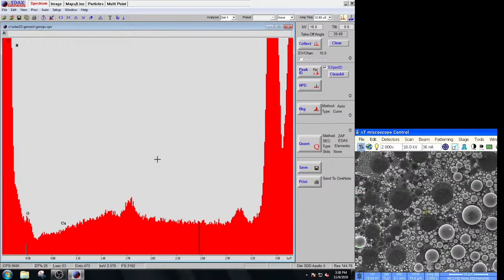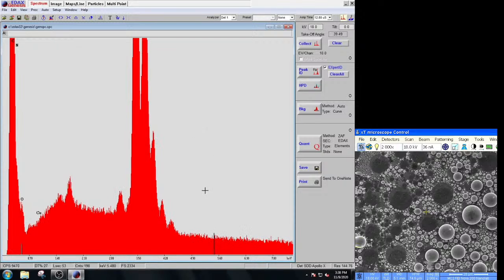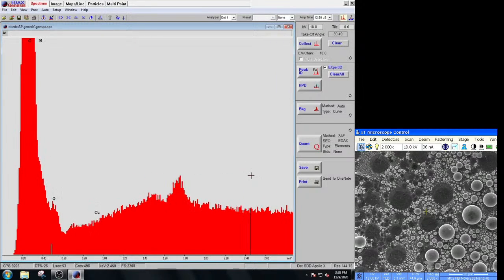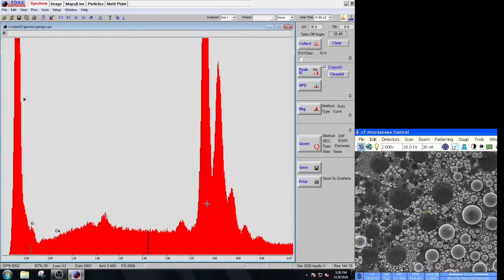There's other shortcuts that involve various aspects of hitting, like the shift key and the control key. So if I hold control and then click and drag to the left, I can shrink the spectrum back down. I guess that's the only one that's really important is control. You can drag up and down to expand or shrink the y-axis.